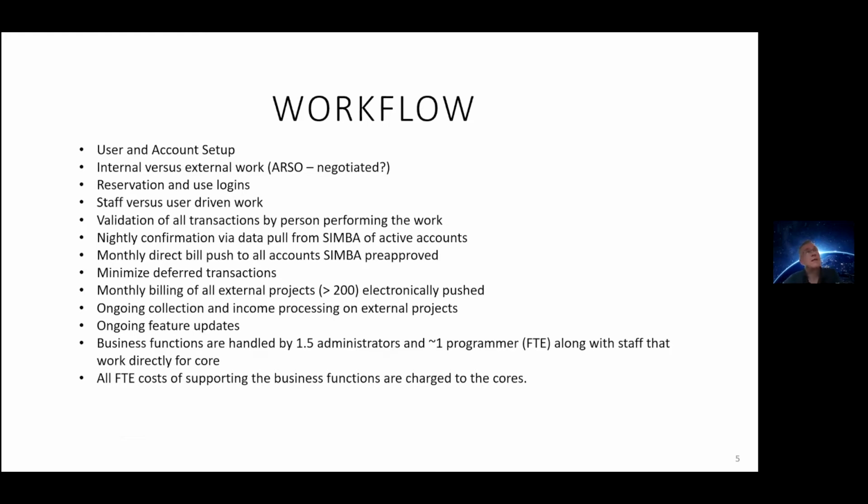So we've gotten the users in the mindset that they can only work when they have an account that works. All the accounts fall under a PI or a responsible party, and users have to request permission from that PI to get an account set up in the system. They get permission, and then their account is active and tied to a budget.